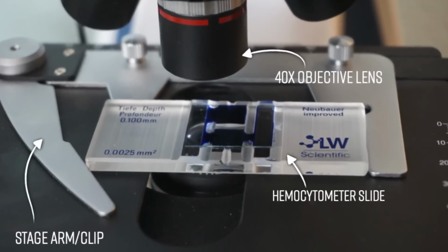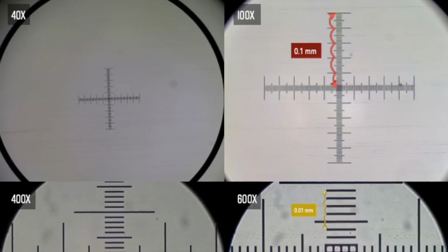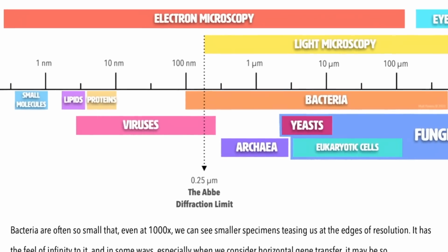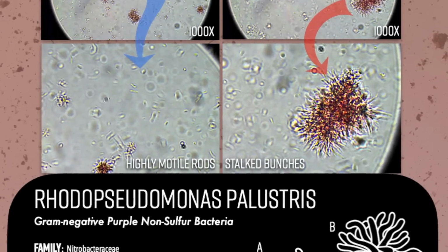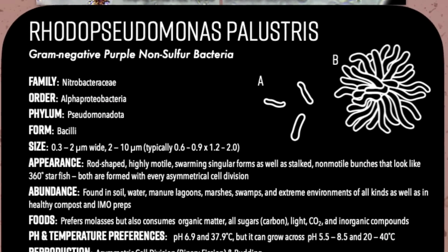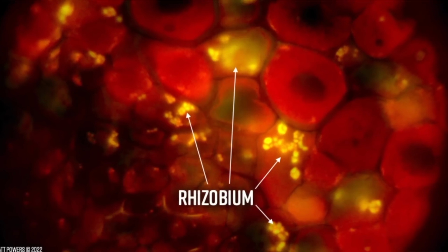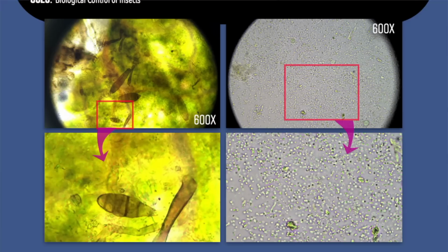And it's also a how to operate the microscope, how to do stains, the recipes, the directions, the step-by-step. That's all in there. But not only that, there's a morphological guide so you can compare what you're seeing against proven lab certified samples. So this is a game changer. This has never been offered before.